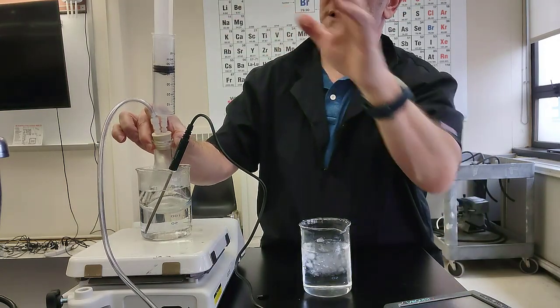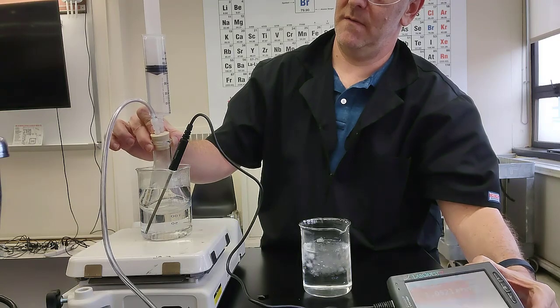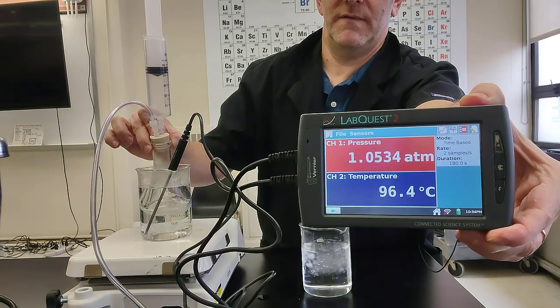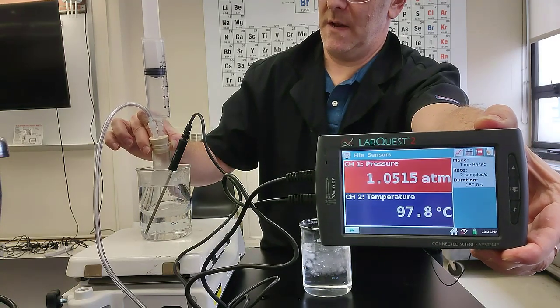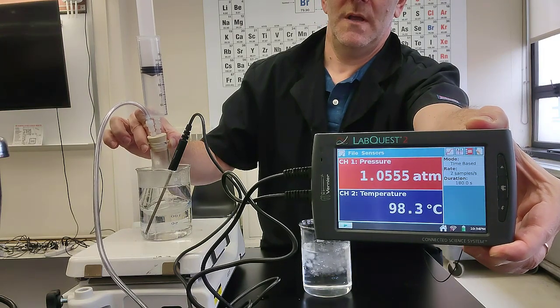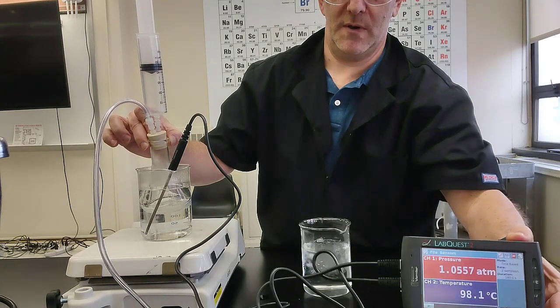Past 40 milliliters now, around 42.5 or so milliliters. And our pressure is relatively constant at 1 atmosphere. Our temperature of our air in the flask should be the same as the temperature of the water in the beaker, which is really close to 100, since it is pretty much boiling.